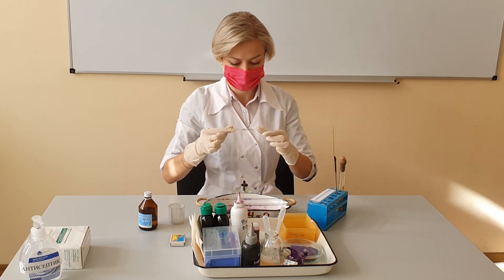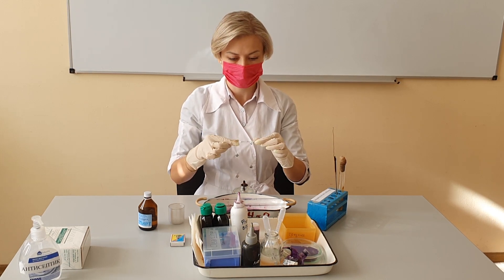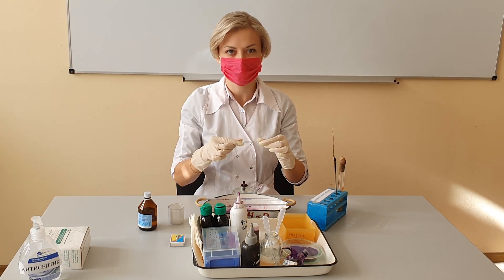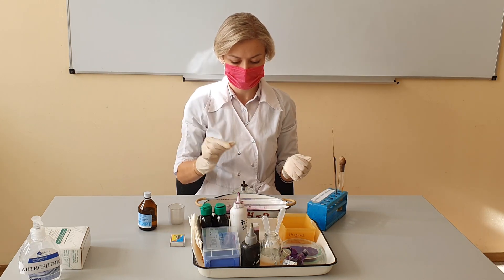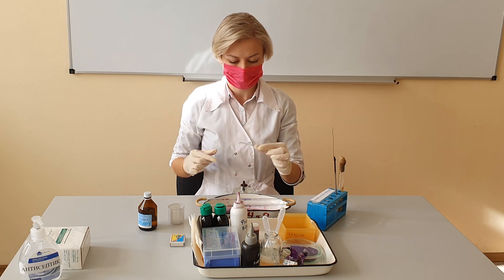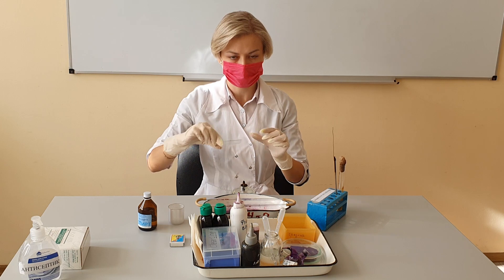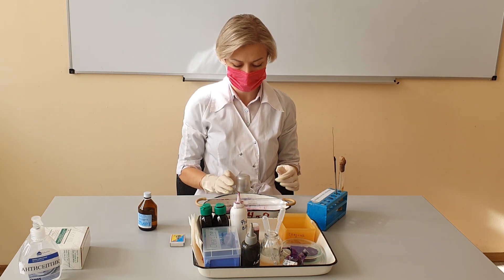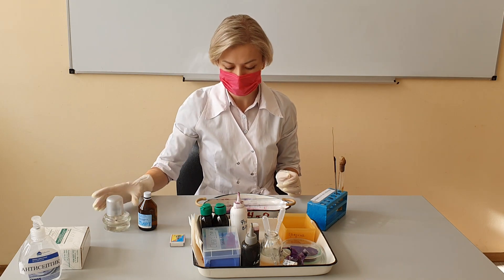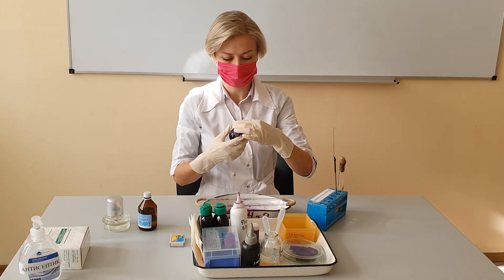Dry the smear over the fire. The main thing is not to overheat the smear so that the bacterial cells don't collapse. Heat fix the sample to the slide by carefully passing the slide with the sample over the flame. Then place your slide on a slide holder or a rack.